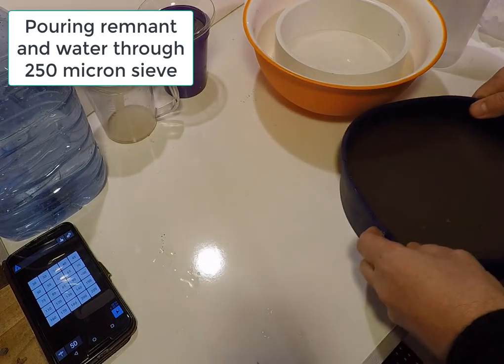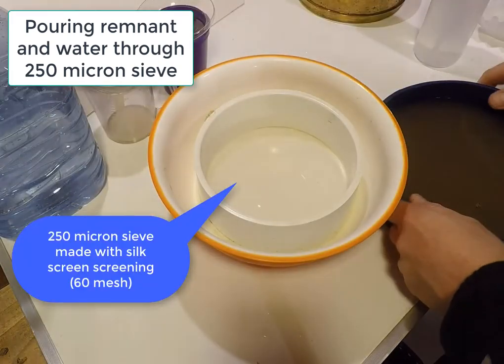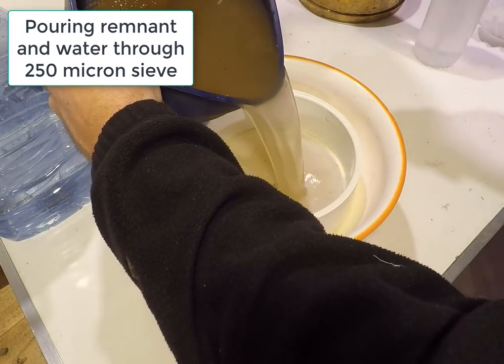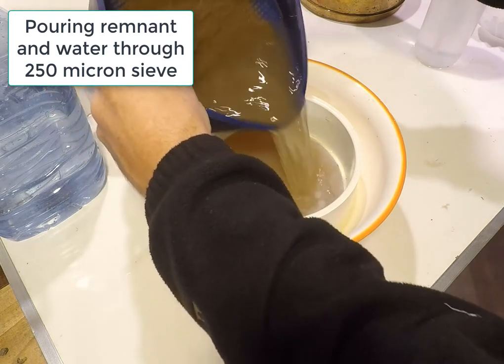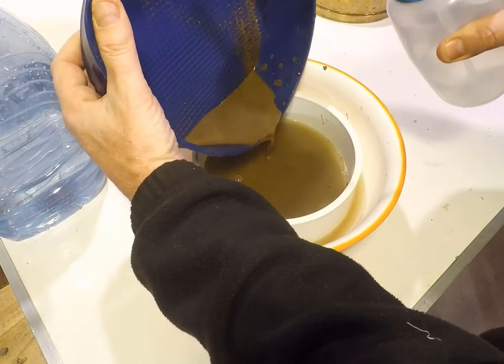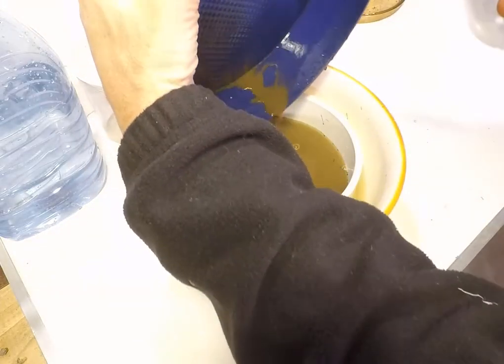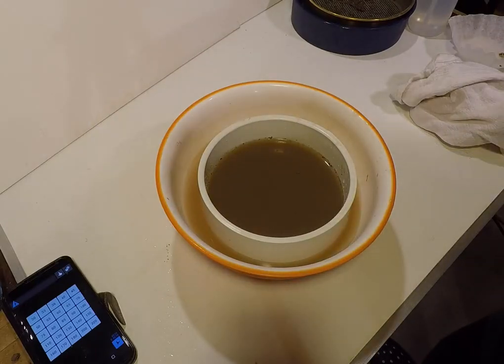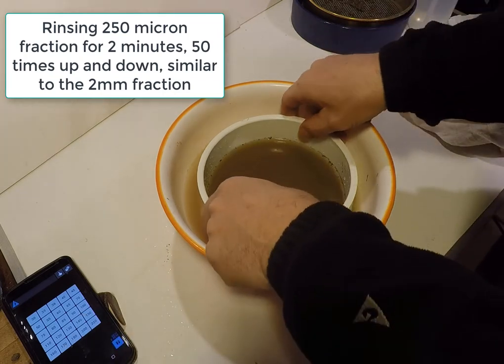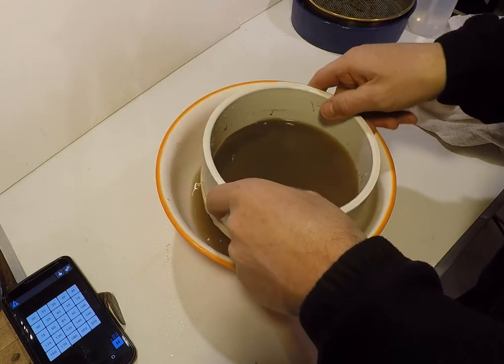The water and soil that was passed through the 2 mm sieve is poured into a 0.25 mm or 250 micron sieve. Water is added to cover the sieve and soil, and then the next smaller fraction of aggregates is washed out of the sample using the same rhythm of 50 strokes in 2 minutes, as was done before for the 2 mm fraction.